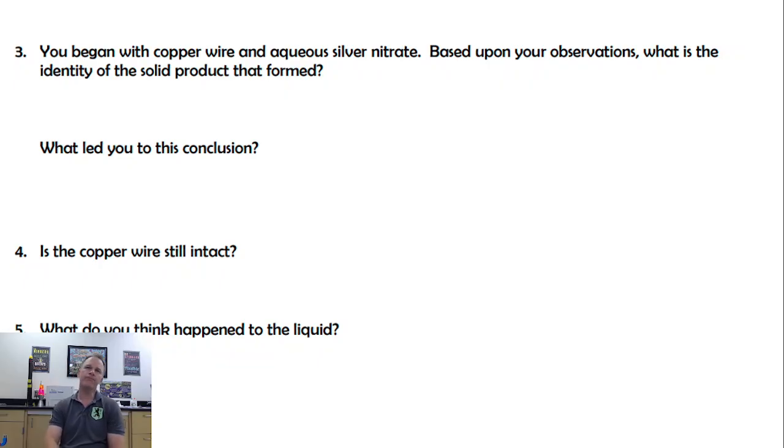Well, did any of you say silver? Like metallic silver, like we started out with metallic copper. Did any of you think that that was metallic silver forming on that copper wire? I mean, we've got a bunch of silver in the liquid. Maybe it's just collecting on that copper wire or concentrating. And actually, that's exactly what's happening.